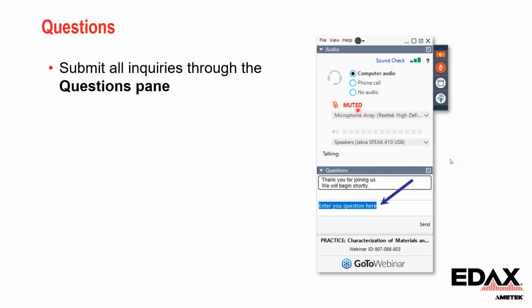Cipher uses the composition by difference method to determine the lithium content in metallic alloys, compounds, and complex metal oxides down to single-digit weight percentages. So you can get this information from our website or our marketing materials.